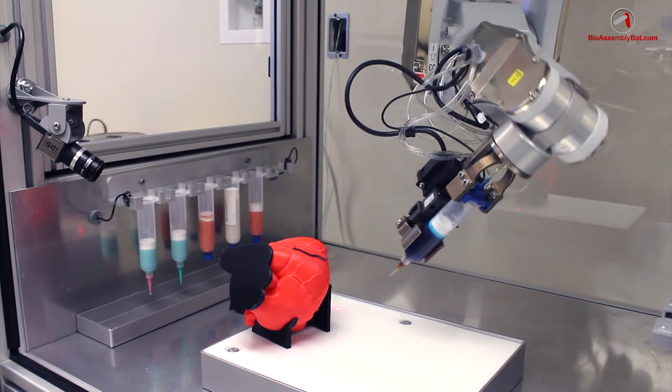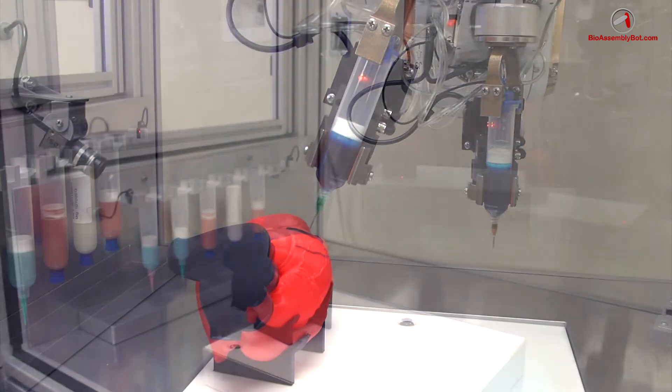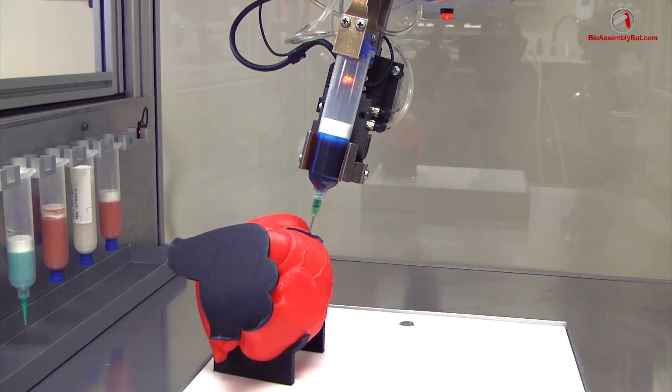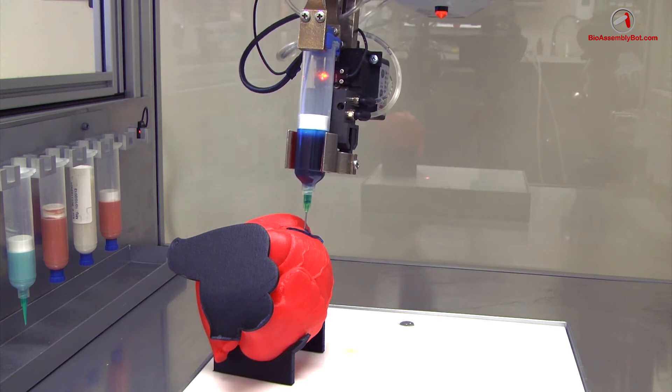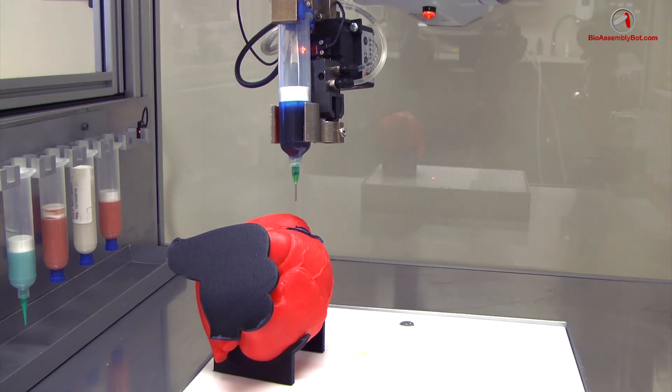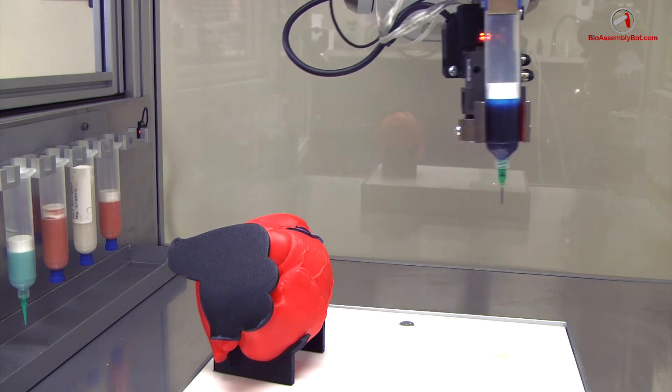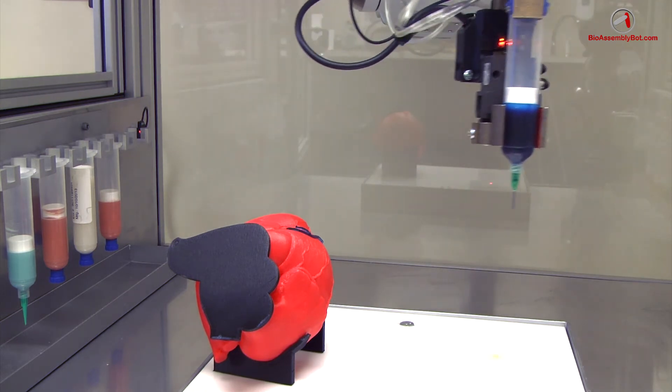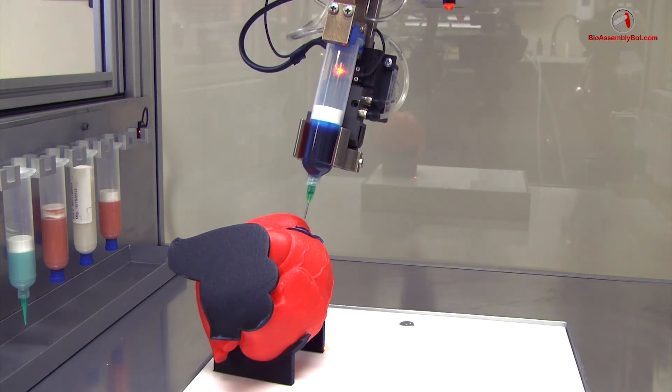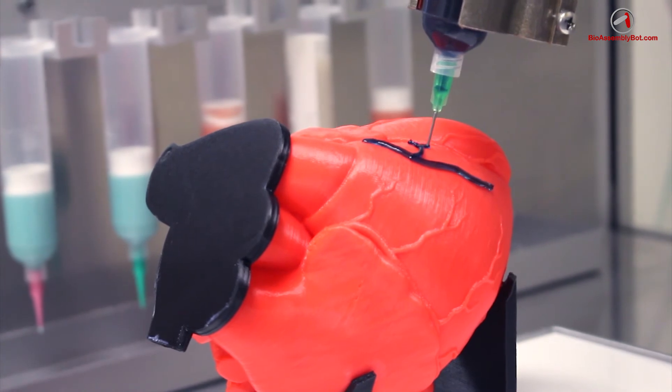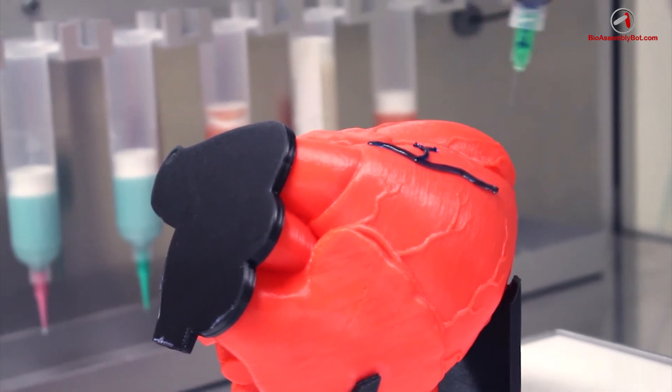Here, the large caliber feed vessel, or artery, is printed first, and now after going over and retrieving the smaller caliber needle cartridge component, the smaller vessel branches are added, including off the main artery as well as off the smaller leading vessels.